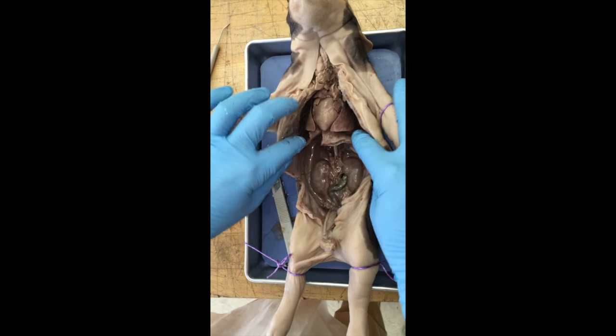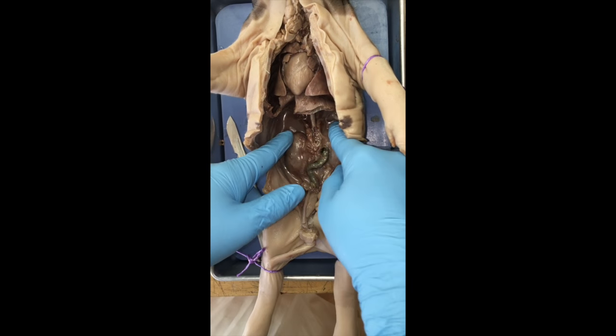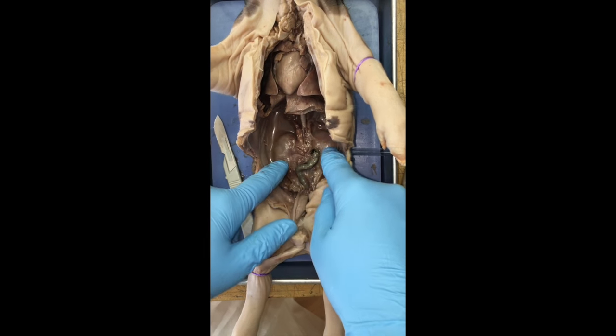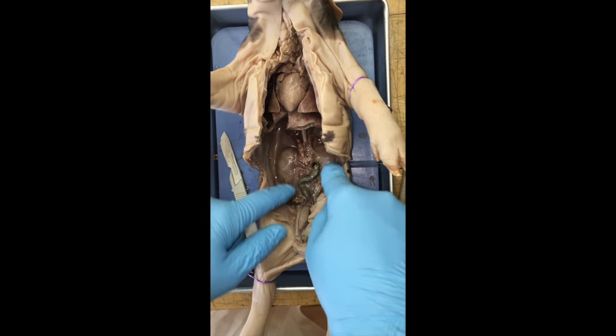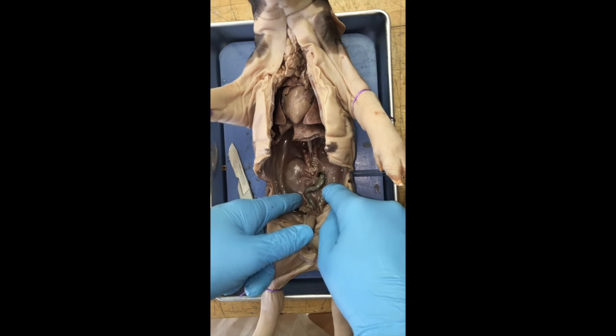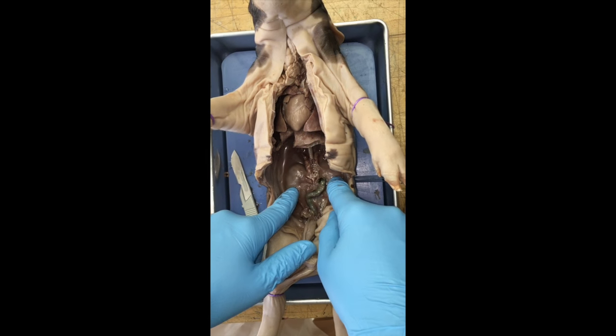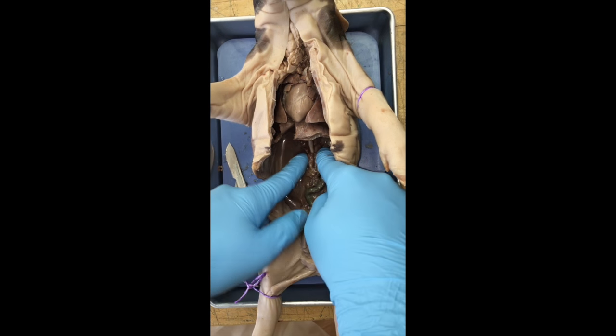If you look down below where we just took the digestive system out, you can see two bean-shaped structures — these are the kidneys. The kidneys are what filter out any waste from the urinary tract. A lot of people might think those were the testicles, but those are the kidneys located on each side of the backbone.